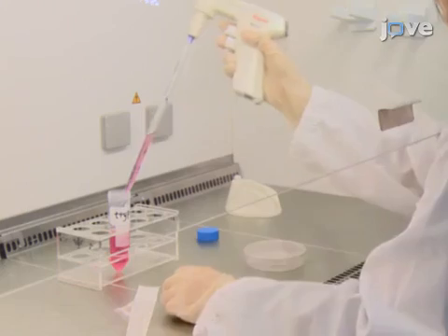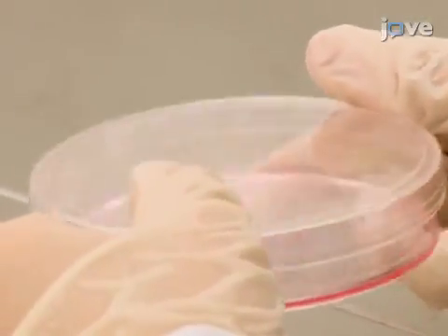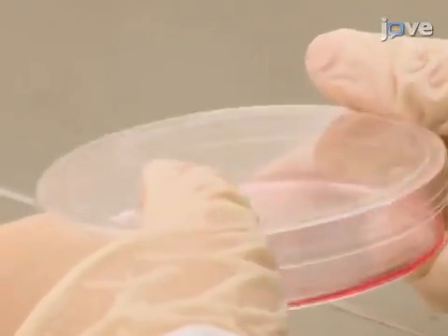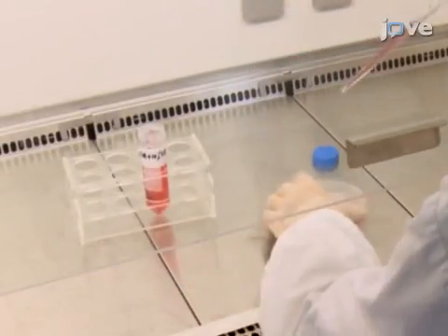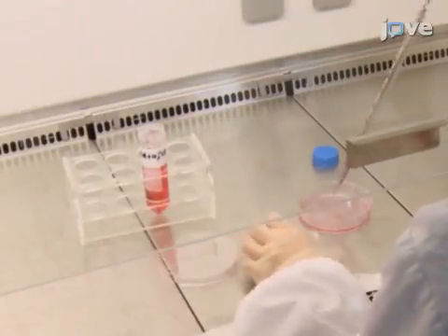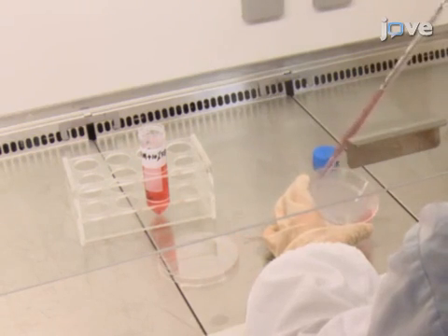Next, add 3 milliliters of 0.05% trypsin EDTA onto the plate. Leave the trypsin on the cells for one minute or until all cells are afloat. Inactivate the trypsin by adding 5 milliliters of MEM with 10% FBS and pipetting up and down to break up chunks of cell mass.